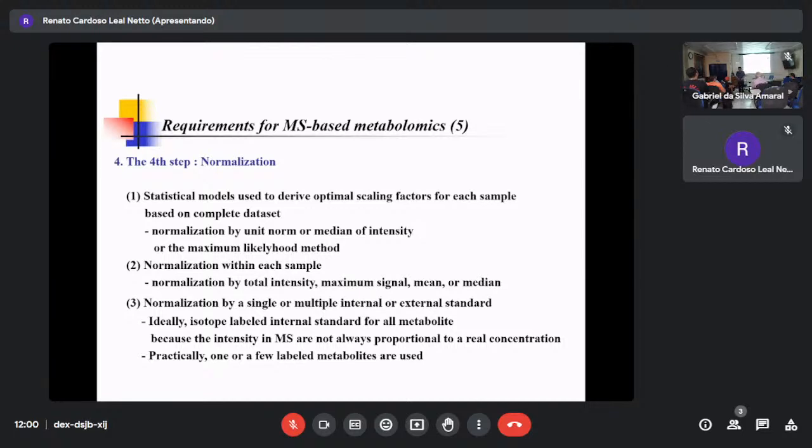And also now I have a diluted urine and a concentrated urine. You added 1 milligram of internal standard, but still it cannot be comparable. Why? And also, when you dry the sample, the water content of this dry sample is different. Even if you weigh 30 milligram, you dry today very completely, it is 30 milligram dry weight, but you did it last Friday. Now you want to go to the party and get this one, then it's only 10 milligram.